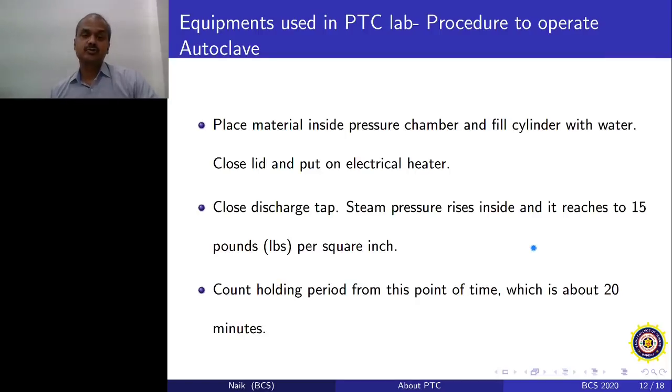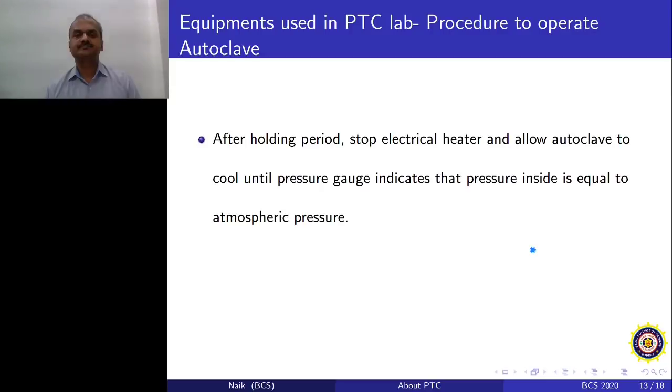You can change the water. You have to change the water of the autoclave, which is generally present at the bottom of the autoclave, quite frequently, because it is staying there for a very long time, and therefore it can get contaminated as well.